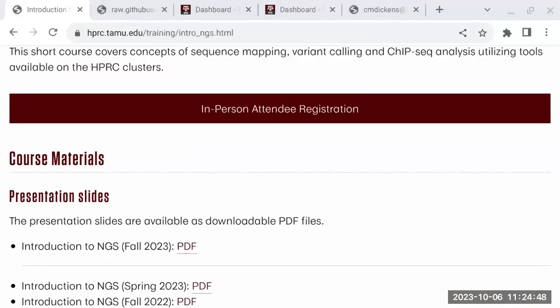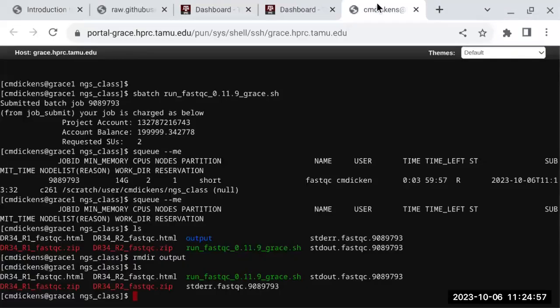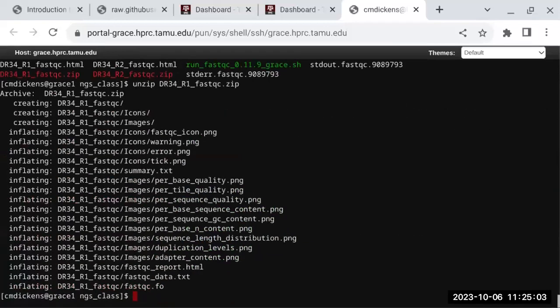Couple people, okay. So the next command is to unzip the zip file. That's where the images are. So back here, we're gonna do the first one, okay? Now it shows you what it unzipped. And if you're using a terminal, a Mac terminal or Linux, you can use links or EOG. Links is used to view the HTML files. EOG is used to view the images. So you can do links and the name of the file.